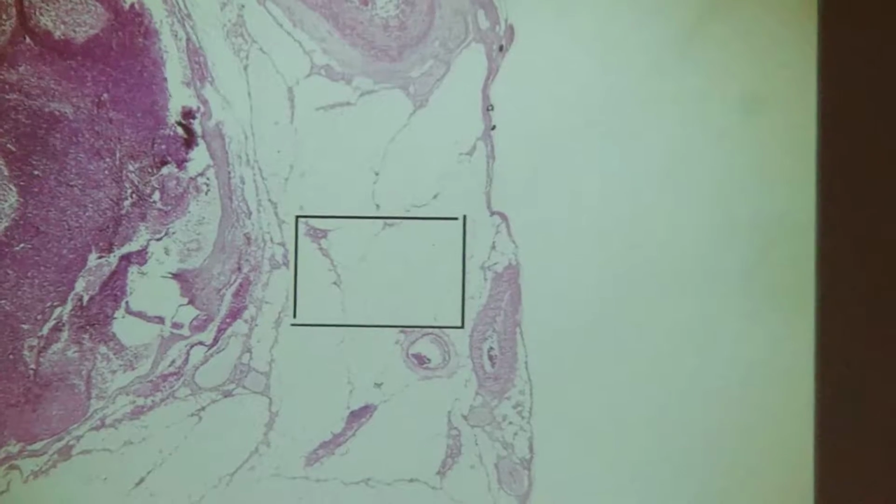Real quick. Is that focusing it? Yeah, it's adipose up to the side. So remember, these slides have different stuff in it. Okay, little section of it.